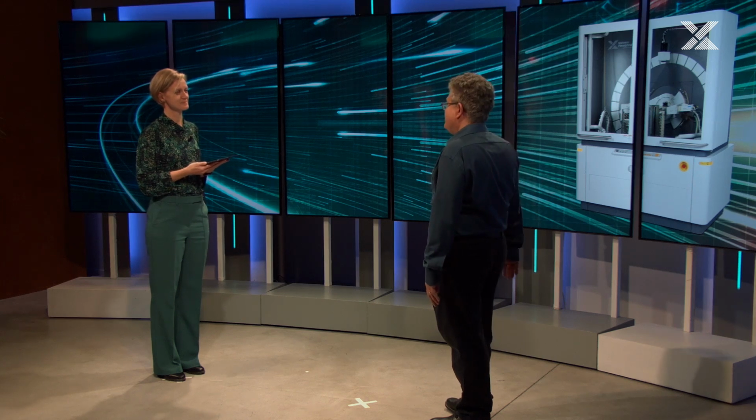Okay. Anything else we need to know? Well, both of these techniques, as well as powder diffraction, can be done on a modern multi-purpose powder diffractometer like you're seeing here, the Empyrean. And if I wanted to reset the instrument from one technique to the other, it takes me about 40 minutes, because I also need to change the radiation tube. But to get from one setup to the other, and I'm ready, it's very easy to do.